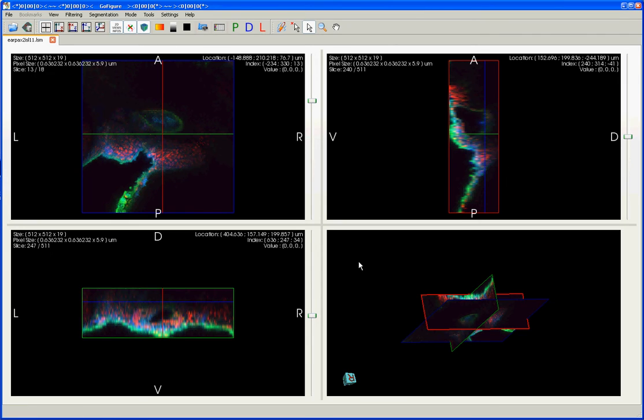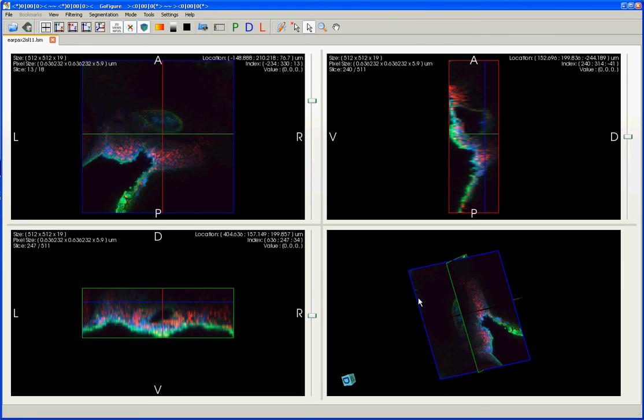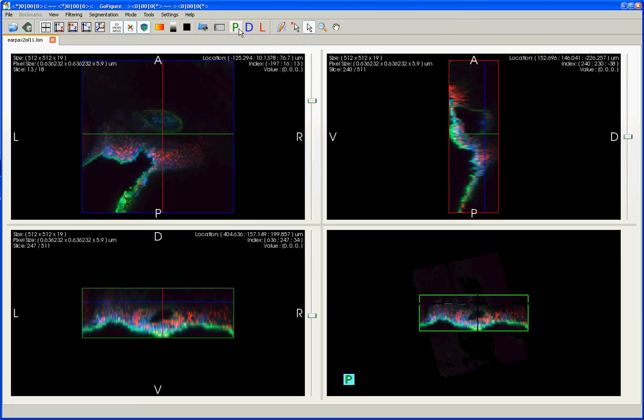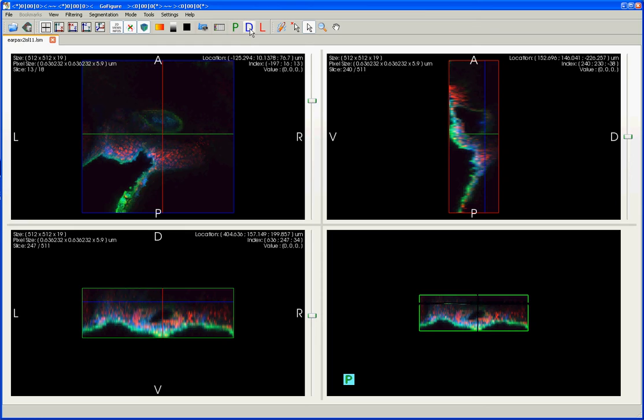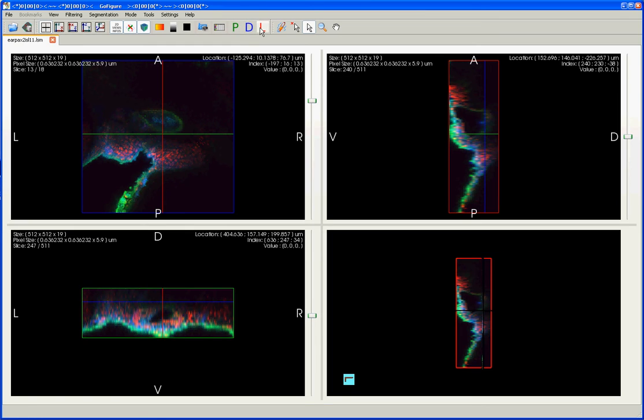You can always reorient your view in the 3D image by clicking and dragging to a new location. But sometimes it's useful to jump to a particular view that you already know you'd like to be looking at, and that's what can be done with these P, D, and L buttons up here. The P button stands for posterior, which allows you to jump to a posterior view of your organism. D will jump to a dorsal view, and L will jump to a view from the left. Now, of course, this naming is based on the assumption that you've imaged your organism from a dorsal view. But regardless of from what view you've imaged your organism, it's still often useful to use these buttons.